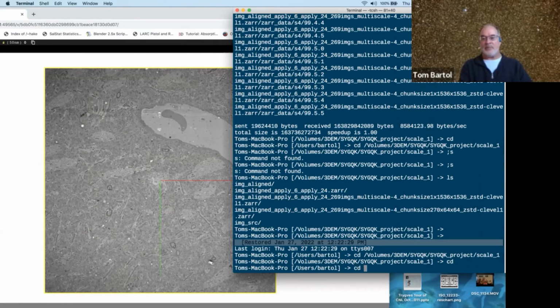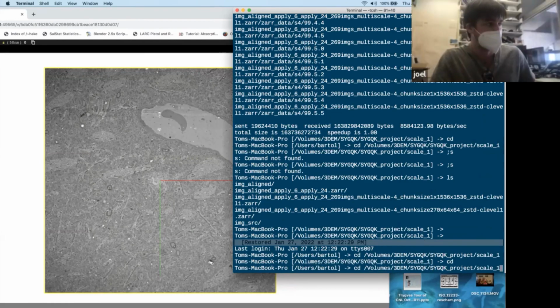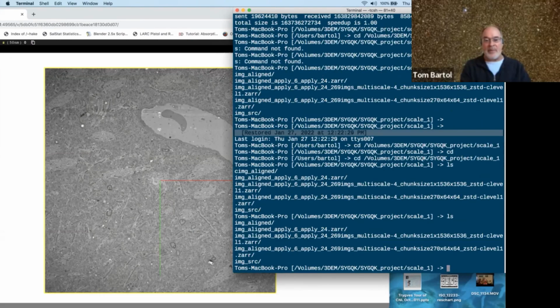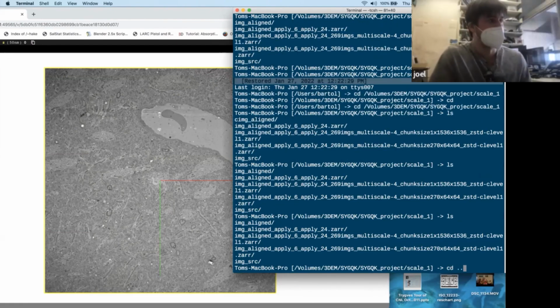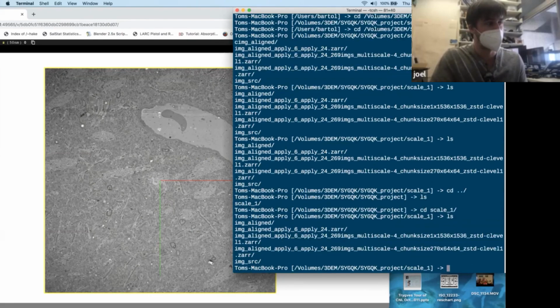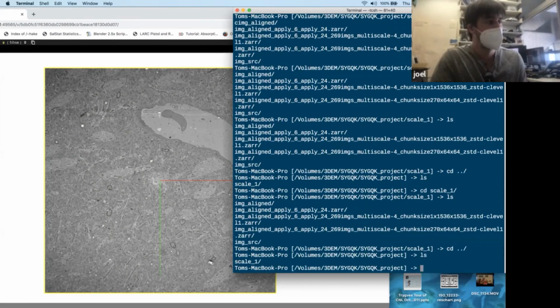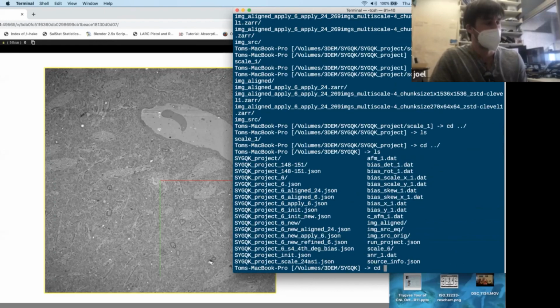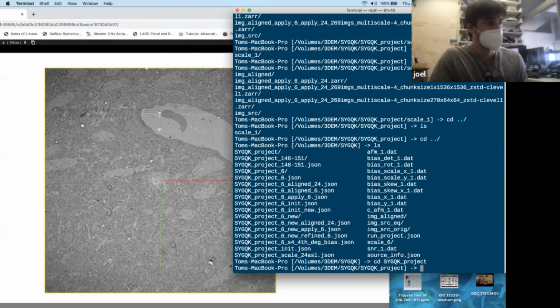Yep, so right. Now that you're running the server here, maybe you can demonstrate the callback functions that I showed you. While you're doing that, I'll just explain that Kristen mentioned last week that she would like to have a blend function. So I did write that as a callback function. So maybe you can demonstrate that now. And then the unchunk function, if you want to demonstrate that.